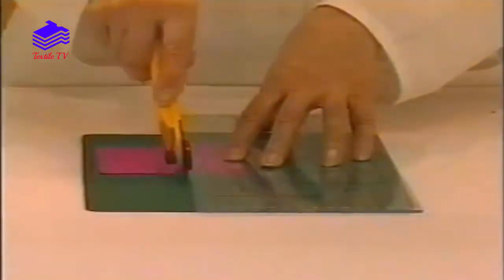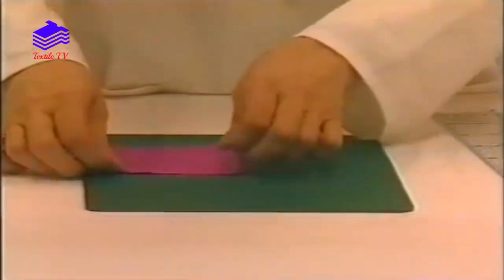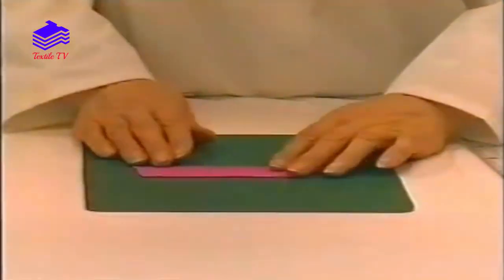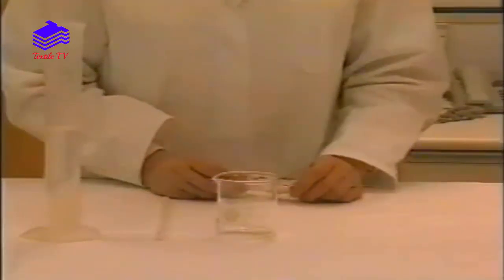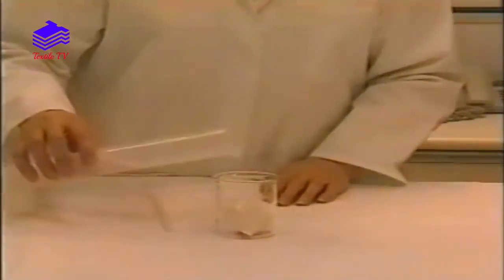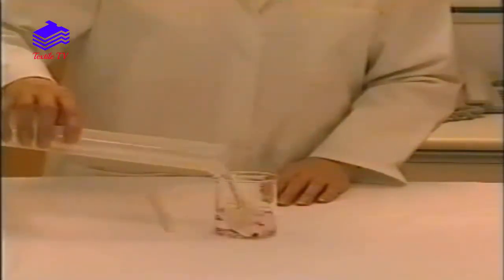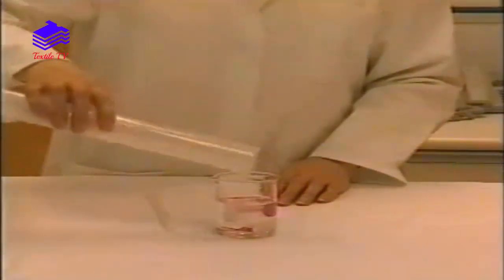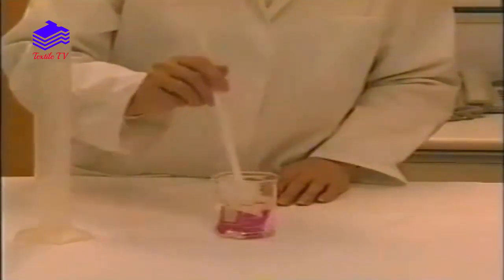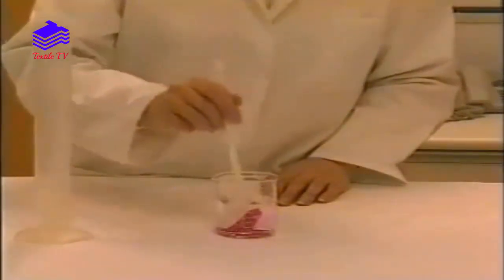A test specimen 100 x 40 mm is cut from the sample provided and attached to a similar sized multifibre strip. The composite specimen is wet out in a beaker with a specified amount of the relevant solution at room temperature. The specimens must be thoroughly wet out and any air bubbles removed.